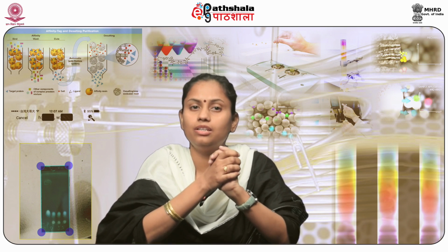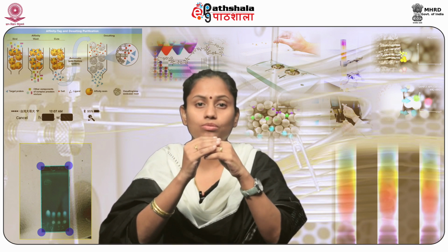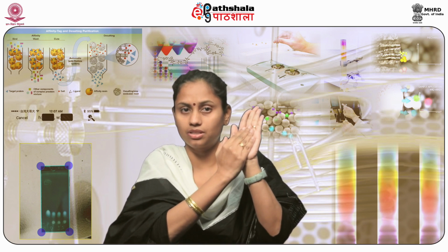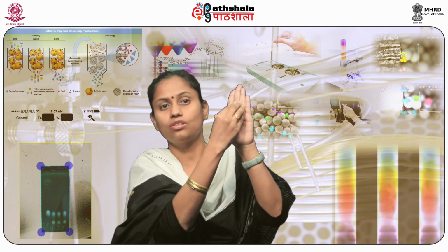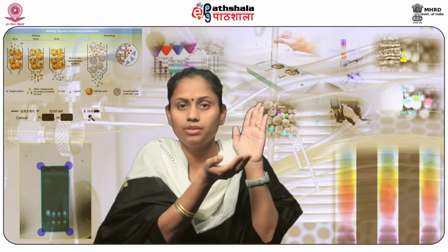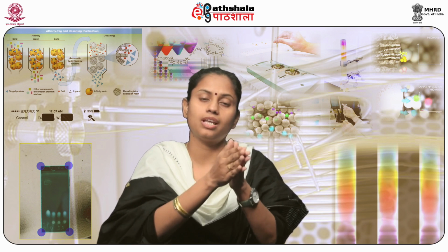Now, when selecting the equilibration buffer, the pH and ionic strength should be taken into consideration so as to ensure that when the sample is loaded, molecules of interest bind to the matrix and as many impurities as possible do not bind and elute out. The molecules that bind are effectively concentrated onto the column, while the contaminants or other substances that do not have the correct surface charge pass through the column along with the flow of buffer, eluting during or just after sample application.